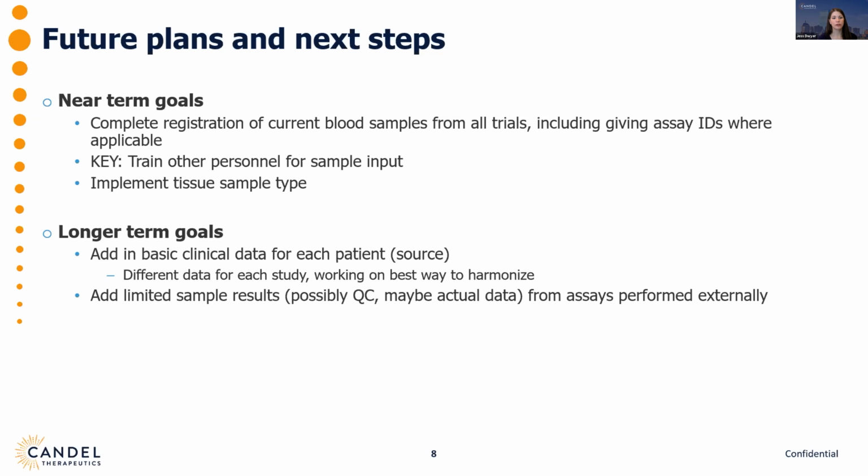But because for each of our studies, we have different sets of data that we want to capture, we have to think about the best way to structure the data so that they can all fit into one set of fields. So because of that, this is more of a longer term goal. But I'm definitely excited to continue forward with Sample Manager.